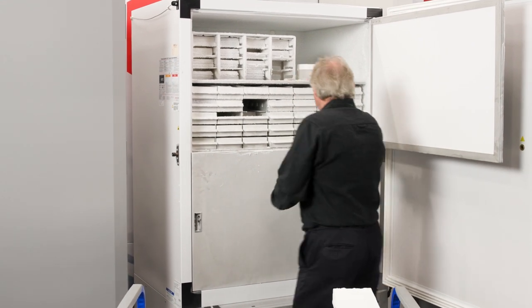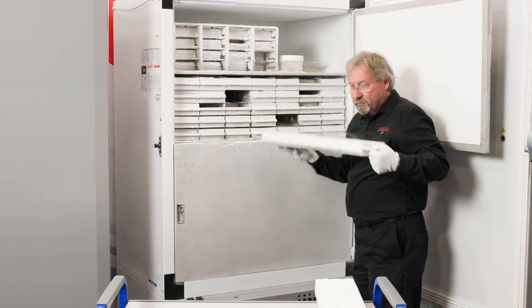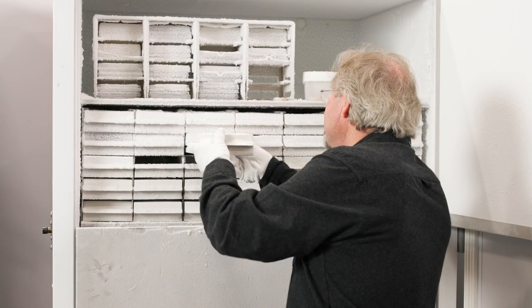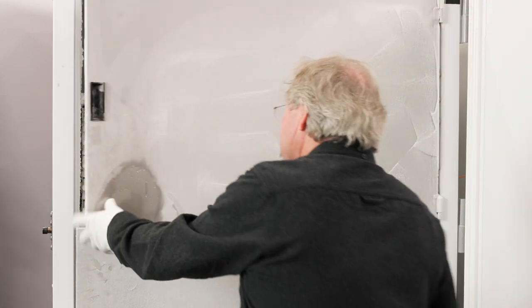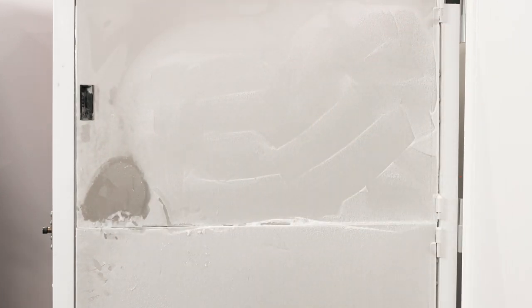Here's an example of an upright storage solution. Upright freezers are ergonomic because they're at eye level and traditionally store samples in standard formats.